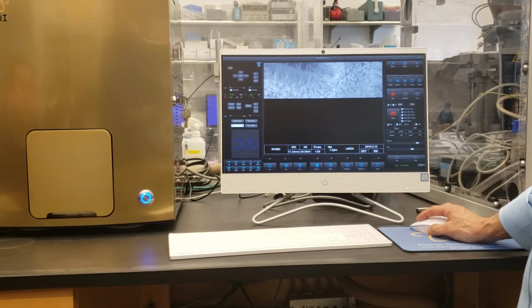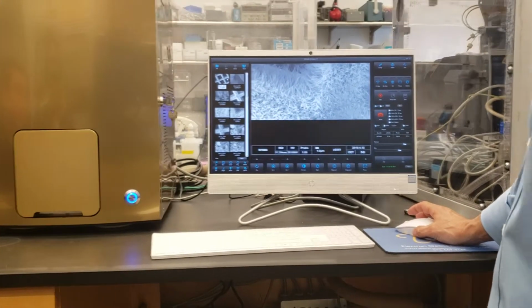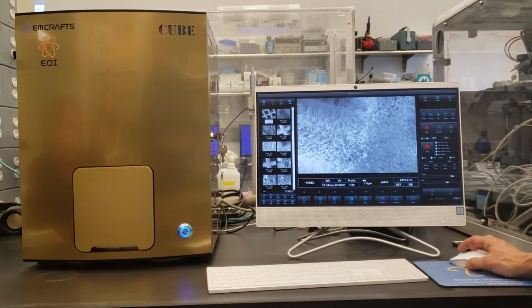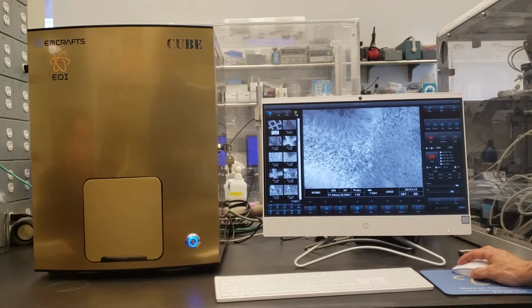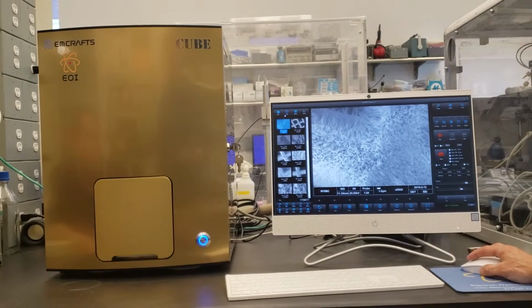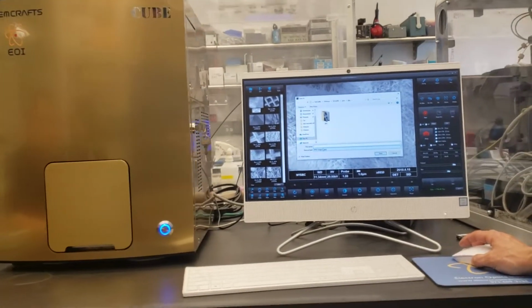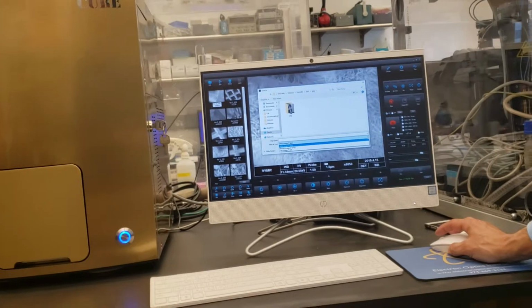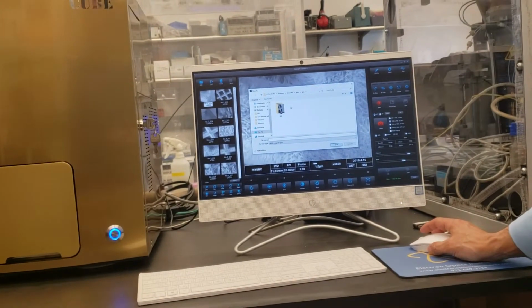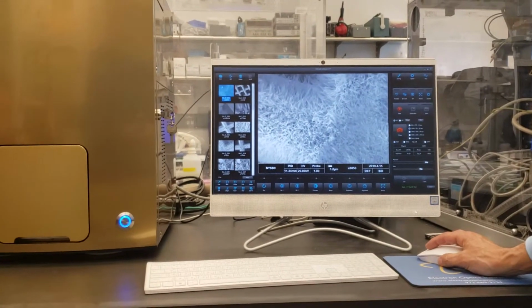And if I move this directory over to my image capture directory, then as soon as this finishes, I could just hit save. So I hit save, and it just saved that image. If I want to export that image, I just left click on it and go export, and it exports it as a JPEG. So wherever you want to go: JPEG or a TIFF or a bitmap, and whatever file or folder you want to save it in. But the file, whatever it took, will be there.